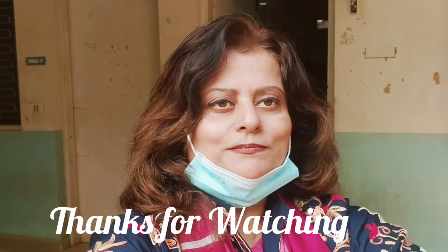Now my students are going along with their number of tests. So I think I should now stop filming because it's just the repetition of all the tests which we have done last week, the previous week and the first week. So hope to see you again with something new and more interesting, and of course with the continuation of the next step which my students will do tomorrow. See you. Bye bye.